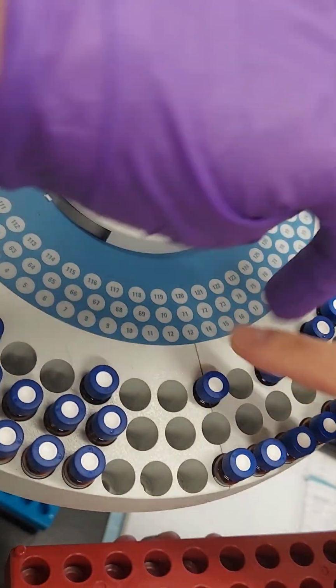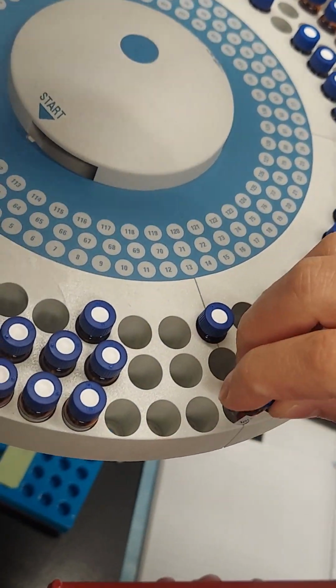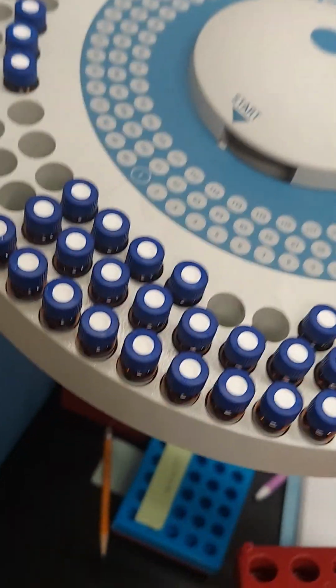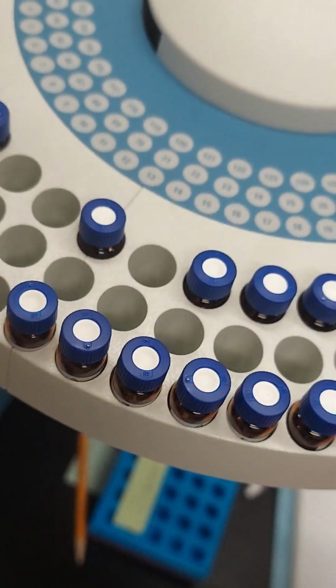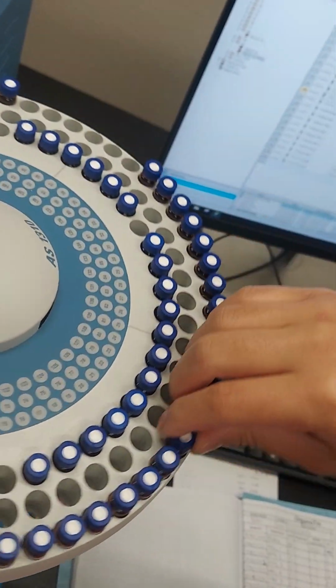What are all those? These are old samples. Okay. So you keep them until it's full, then clean it? No, you should clean it. Okay. Jesse hasn't been here in a while.